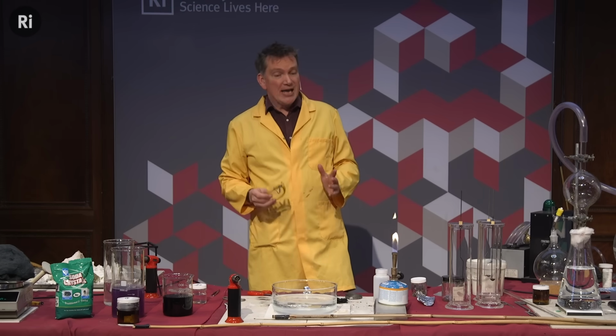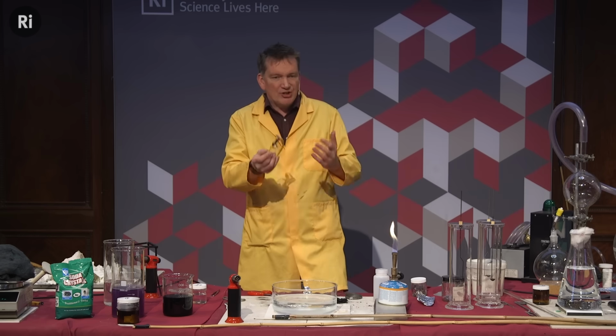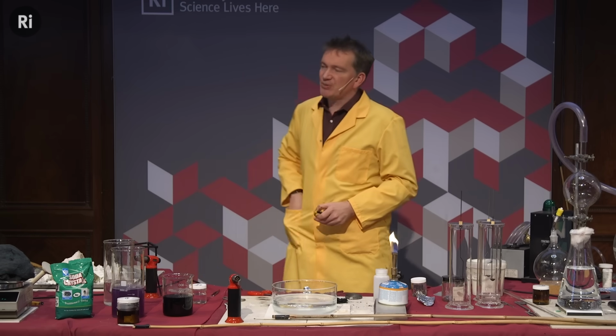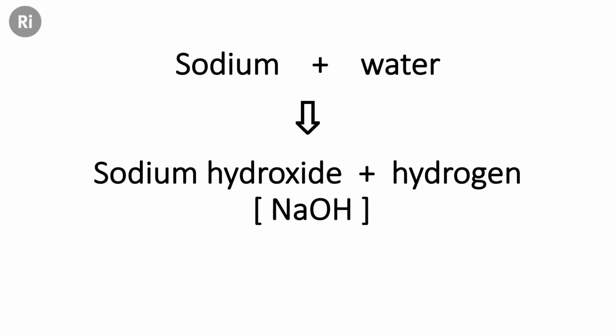But remarkably, even though this reaction has been known ever since Davy's time, this explosion, it was thought that it was exploding because of the hydrogen that's given out during this reaction. But actually, it isn't. And the reason for this has only recently, within the last few years, been discovered.